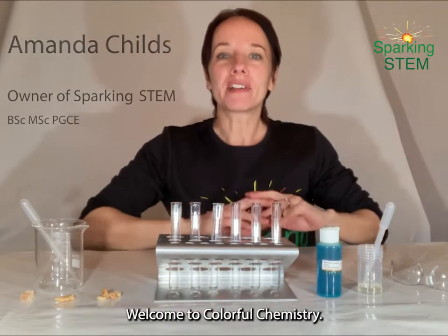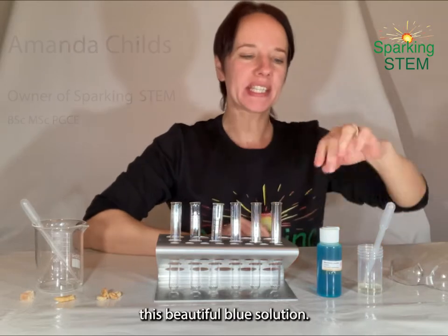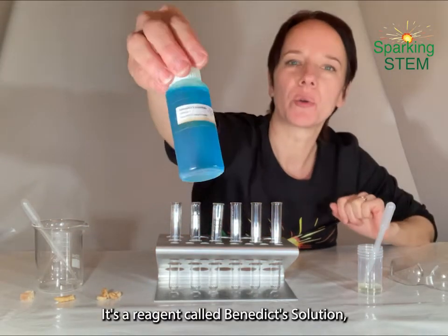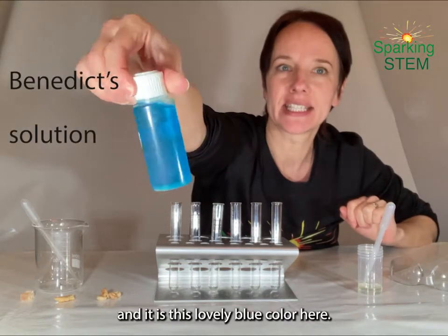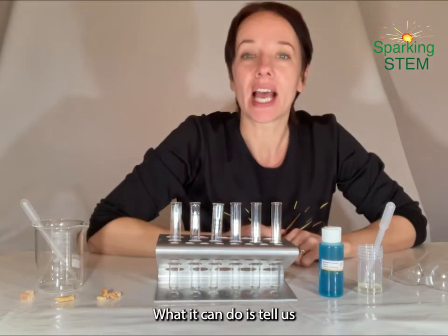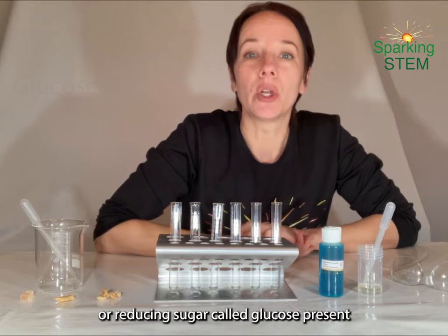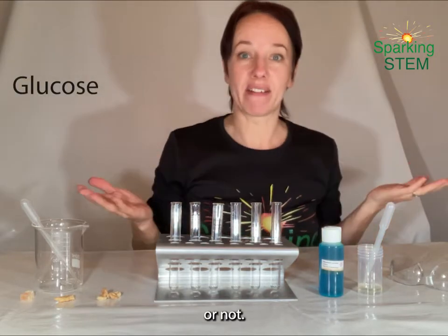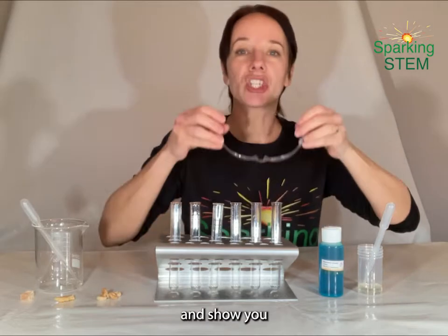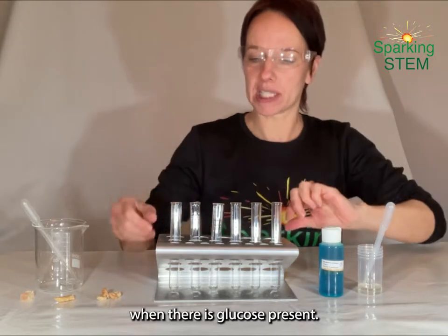Hello, welcome to Colourful Chemistry. I'm going to show you today a reaction that uses this beautiful blue solution. It's a reagent called Benedict's solution and it is this lovely blue colour here. What it can do is tell us whether there is a simple sugar or reducing sugar called glucose present in various things. So we're going to test this today and show you all the wonderful colours that we can get when there is glucose present.